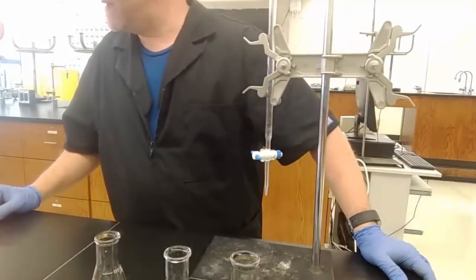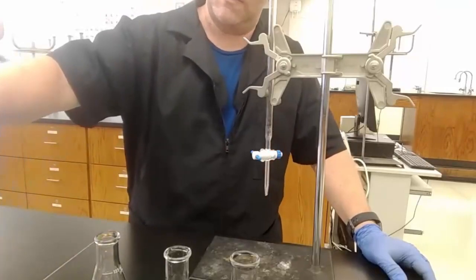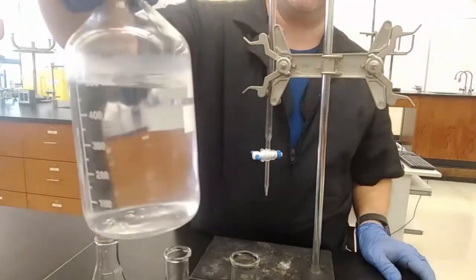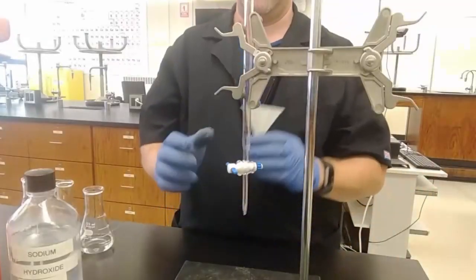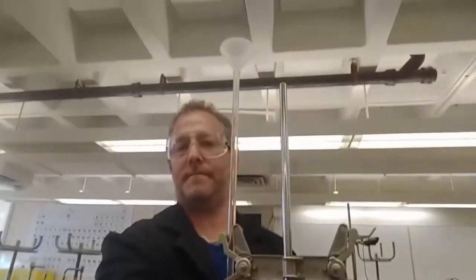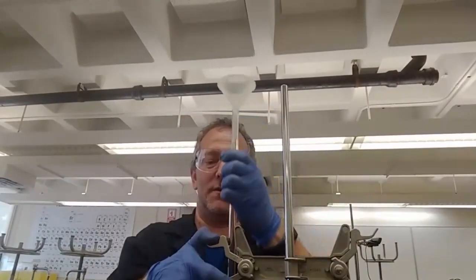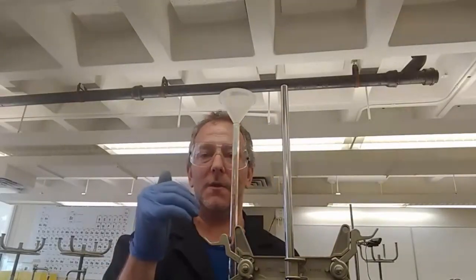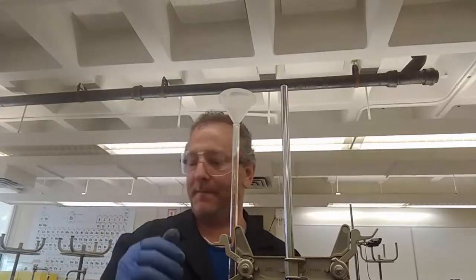Step 7, use a funnel to carefully fill the burette with an aqueous 0.5 molar NaOH solution. I have aqueous sodium hydroxide, 0.5 molar solution. I have a funnel, and I'm going to put it in the top. You guys see that? Which is a little bit over my head, which is kind of dangerous. So I'm going to bring it down as low as I can. If I couldn't get it down any lower, because the burette was longer, I would get a step stool and climb up.